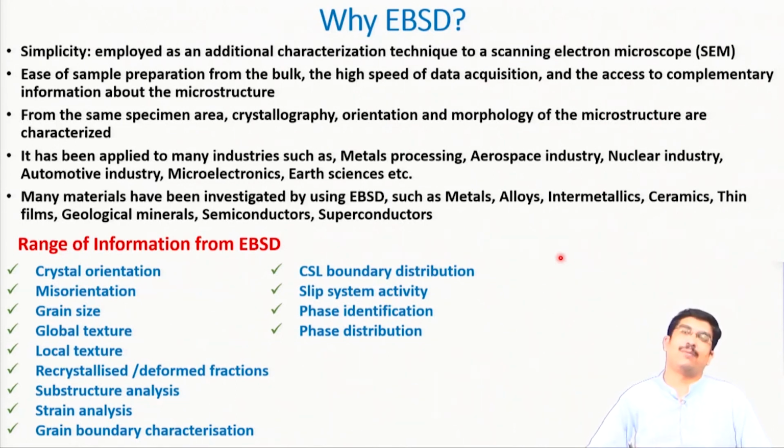That is one of the major drawbacks of transmission electron microscopy. There the data that you capture is very nicely spatially resolved, but not statistically reliable. On the other hand, if you capture orientation data, diffraction based data, from an X-ray technique, you can have very good statistics from a large area, but you lose the spatial resolution. That means the connection with the microstructure is not so easily made in an X-ray technique. So EBSD is somewhere in between.